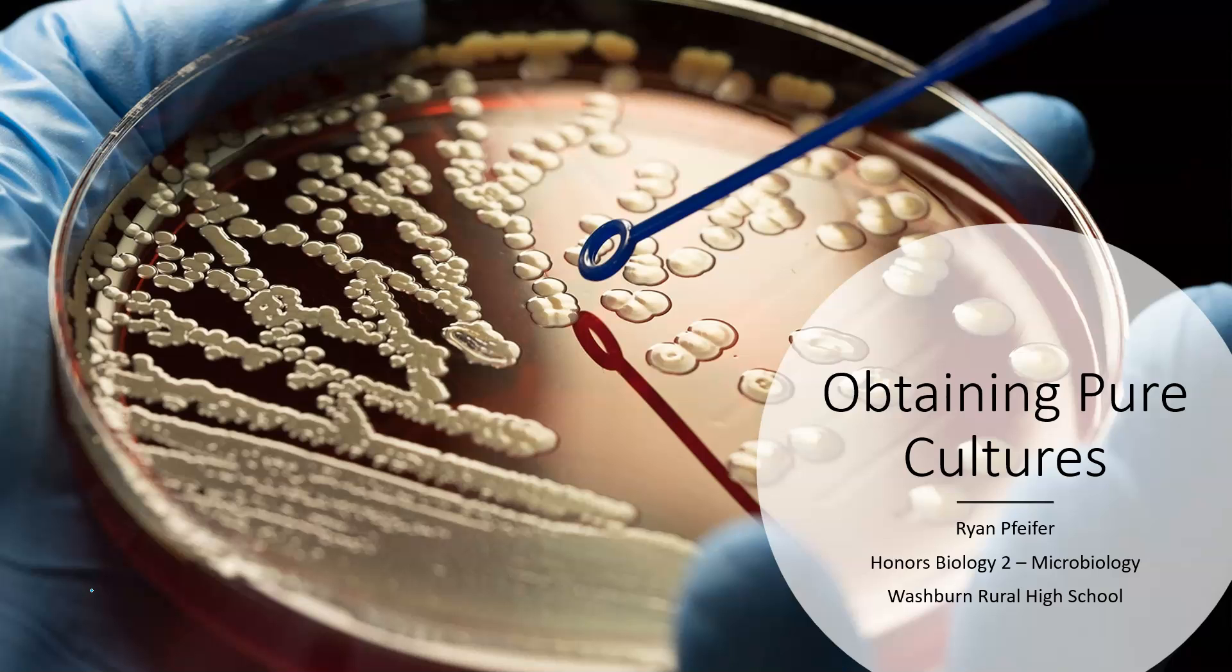There's really one method we're going to focus on and that is the streak plate method. On this thumbnail you can see a proper streak plate which has a section of bacteria that is very concentrated. As we go through that streak plate method which you've done in class, you can successfully isolate pure cultures that you can then take with your inoculation loop and transfer as inoculum to whatever sample you're working with.